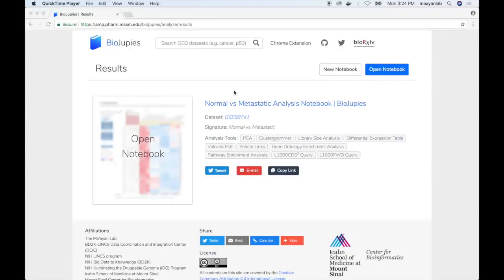Once the notebook generation job has been completed, a link to the Jupyter Notebook will be displayed on the BioJupies website, including a summary of the signature, both the analysis plug-ins used to generate the notebook, as well as options to share the notebook on social media.